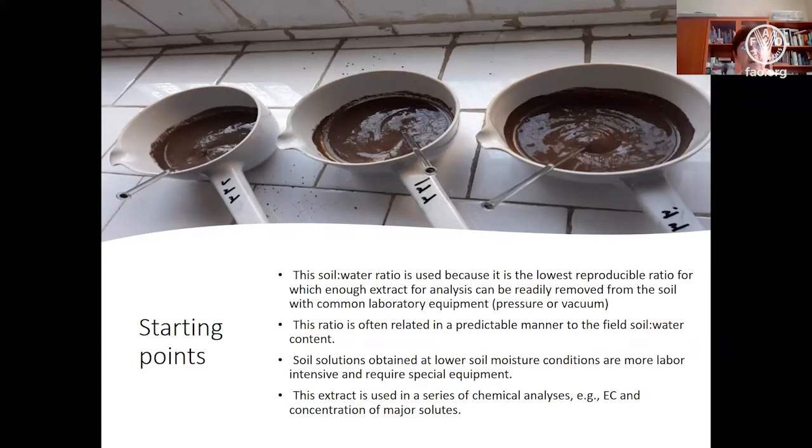Soil solution obtained at lower soil moisture conditions is more labor intensive and requires special equipment. And finally, this extract is used in a series of chemical analyses, primarily to measure electrical conductivity and concentration of major solutes.